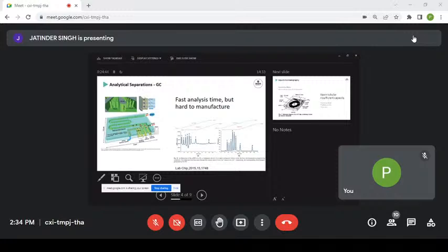And that's why with a detector, we can actually measure the different groups coming out, because they come out at their own characteristic time. And here we've got an integrated detector, where I need to figure out what I need. Better font here. It was not a FID. Should have written down what the PID detector, that was the one.